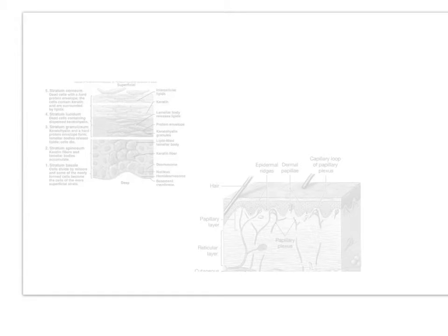So we're going to zoom in one more. So do that now, zoom in, and then we're going to sort of move the magnification in and out till you get a clear view. Can you really see the layers of those hair shafts?